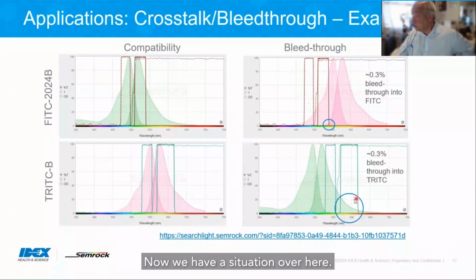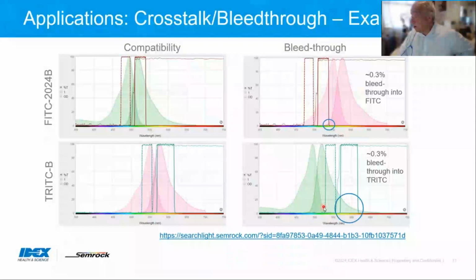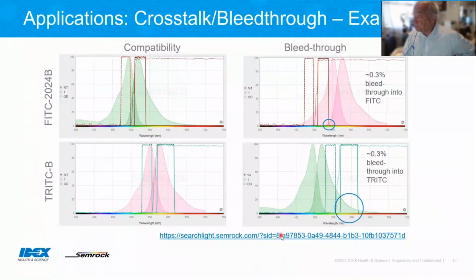An analogous situation over here. Again, there's a certain amount of excitation of the wrong channel, which then bleeds into the TRITC signal.